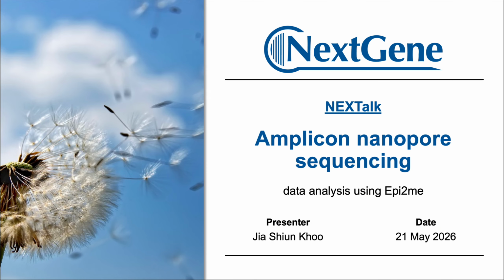You mentioned adaptive sampling in the earlier presentation as well, right? Yes, Amplicon sequencing and adaptive sampling. If I want to do adaptive sampling on some gene clusters in a human sample, which workflow in EPI2ME should I use? Supposedly for adaptive sampling, we should be using the human variation workflow.